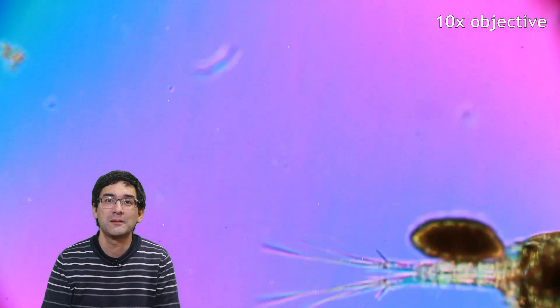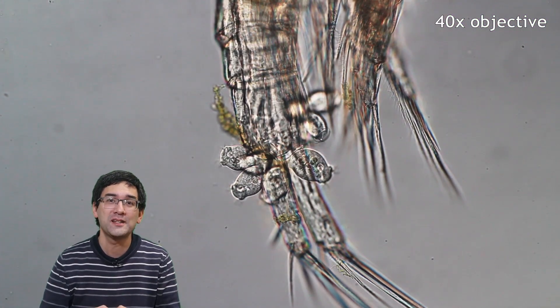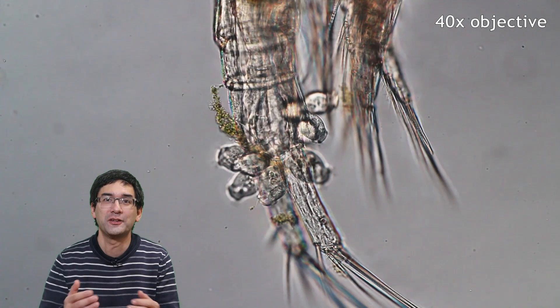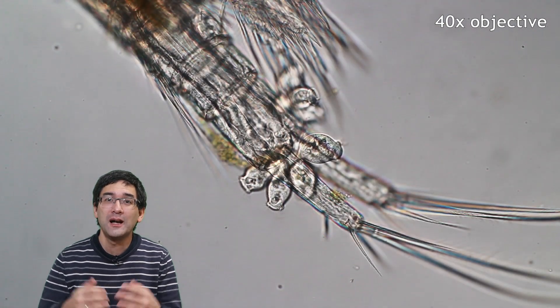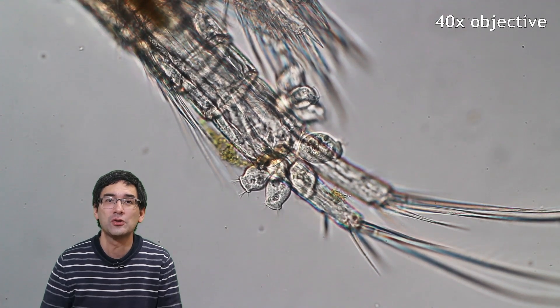This one had some eggs attached to it. On the tail of this critter you can also see some vorticella. Vorticella are ciliates — they grow on the tail almost like parasites. You can see them again here as well. They are very nice, interesting little organisms to observe.